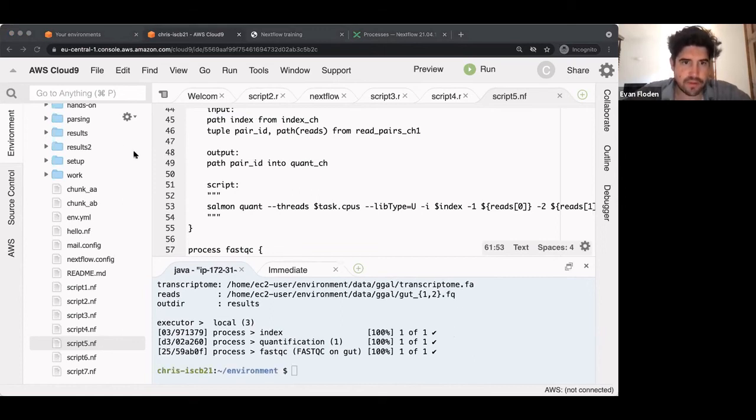Let's bring this all together now before we take our final break. With what's happened so far, I want you to now run script number 5. I want you to run that on all of the samples. So this is still running on all.